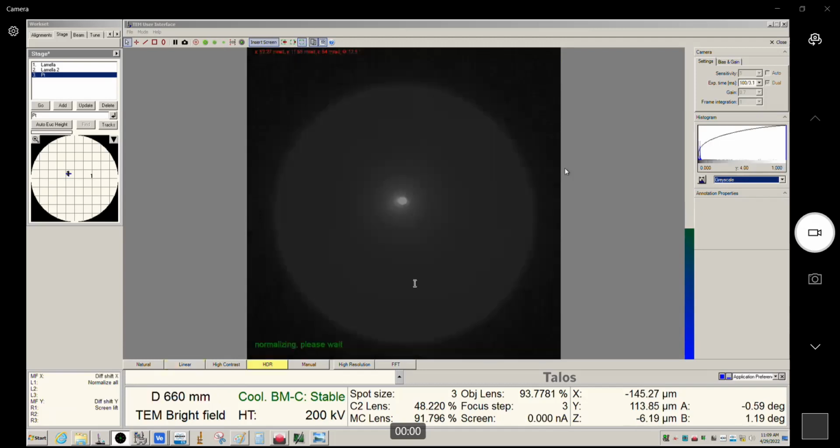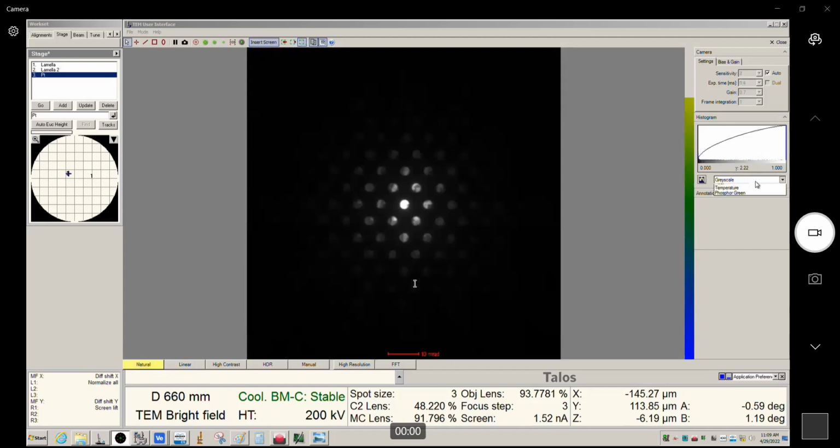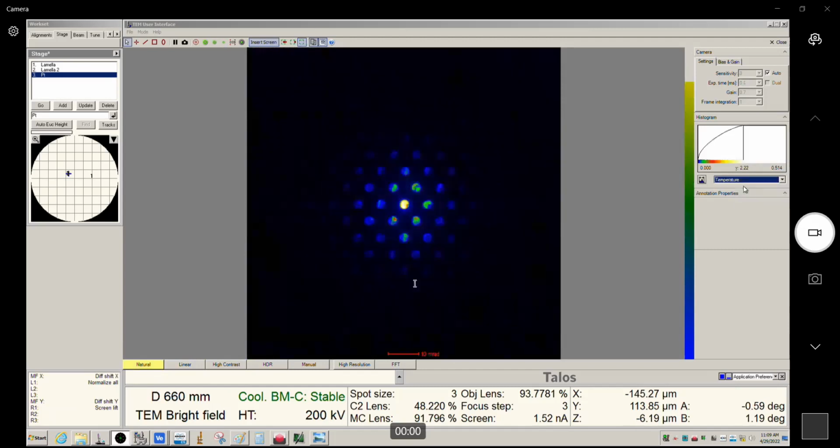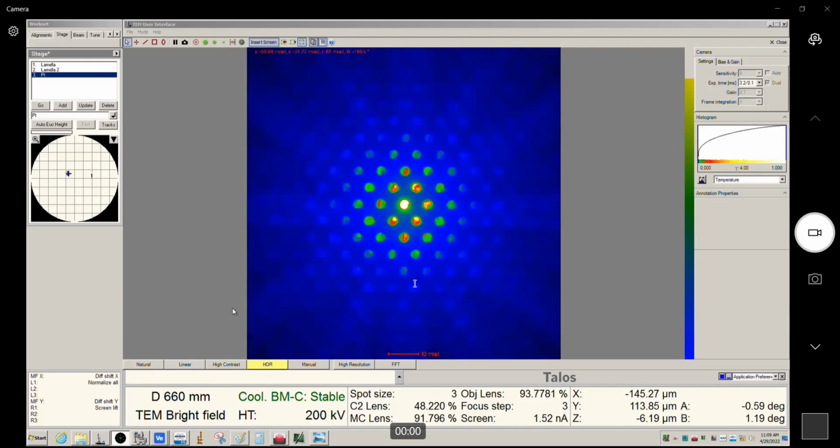Check one more time here. All right, it looks... temperature. All right, so now we're probably off a little bit the other way. This is common. There we go. So it's just pretty close.